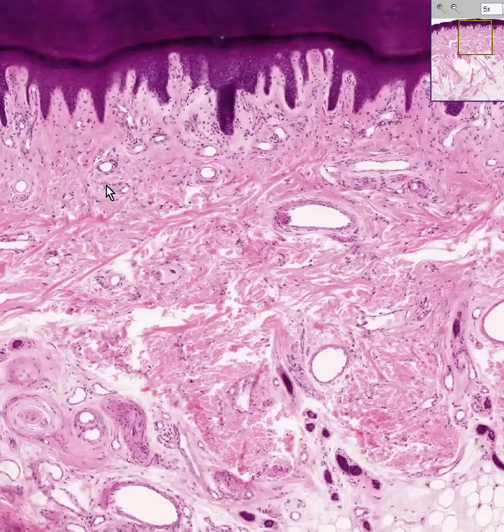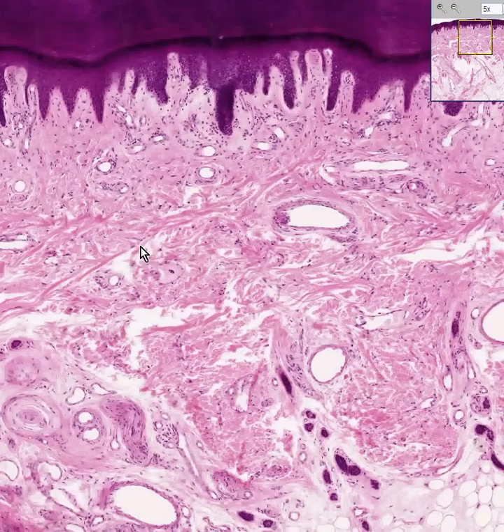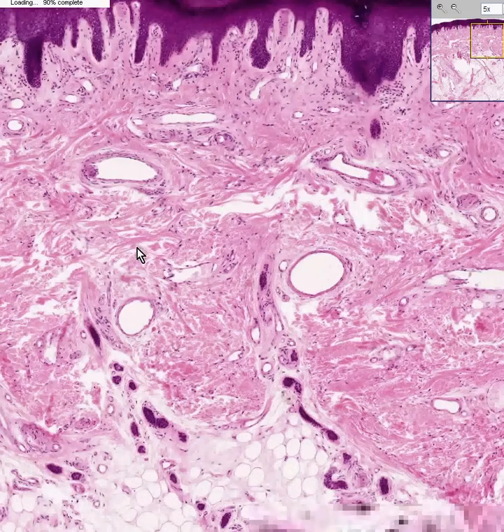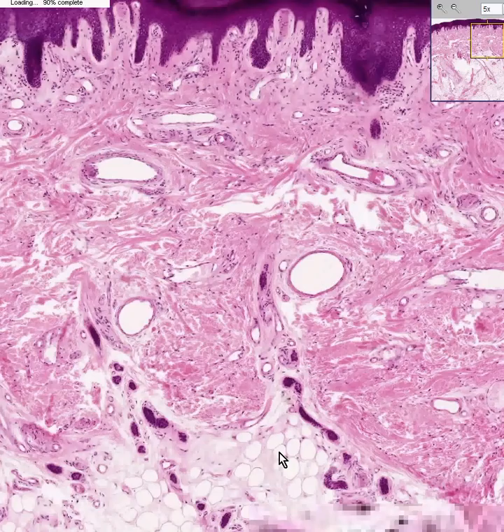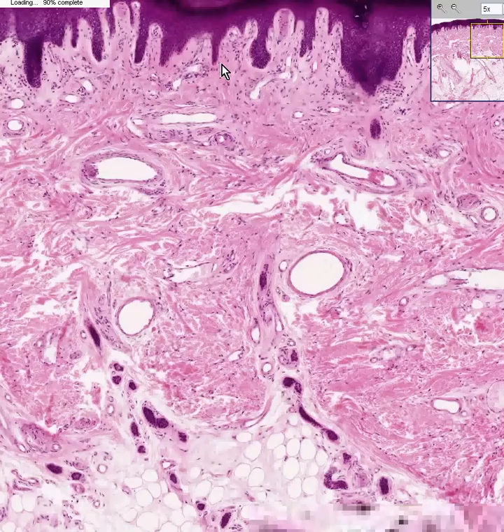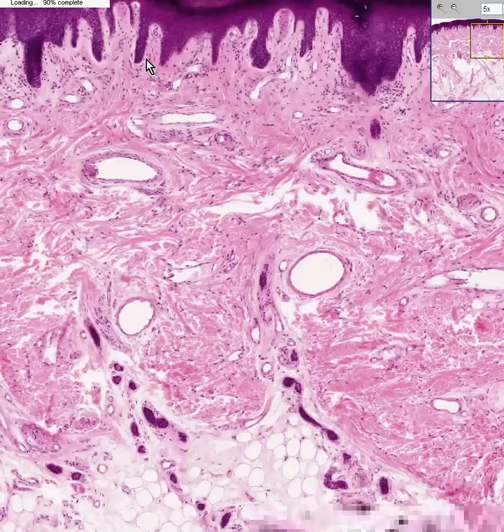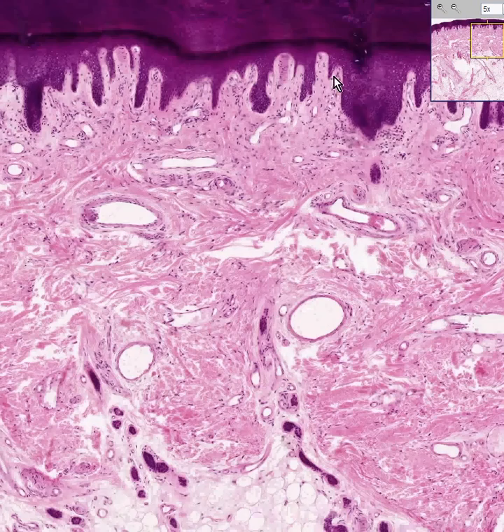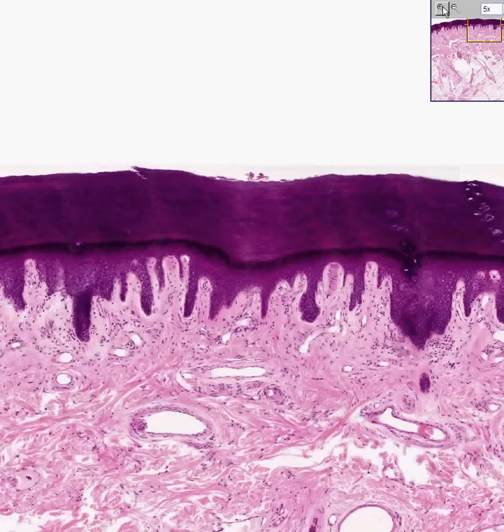Once again, you can see the connective tissue between the rete pegs of the epidermis — that is the papillary dermis — and then this thicker material down here is the reticular dermis. Here is the subcutaneous fat again. Here are the ducts of the eccrine sweat glands; these large open spaces are blood vessels. This looser connective tissue towards the superficial portion of the dermis is papillary dermis. We can also see the elongated rete pegs of the epidermis extending all the way from the basal layer, or stratum germinativum, to the non-nucleated stratum corneum.